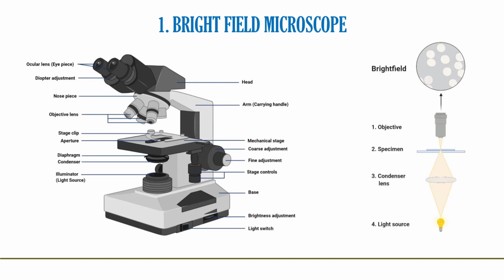They are held together by a sturdy metallic curved back used as an arm and a stand at the bottom, known as the base of the microscope. The arm and the base hold all the parts of the microscope. The stage is where the specimen is placed, allowing movement of the specimen around for better viewing with the flexible knobs, and it is where the light is focused. Two focusing knobs, the fine adjustment knob and the coarse adjustment knob, are found on the microscope's arm, which can move the stage or the nosepiece to focus on the image.